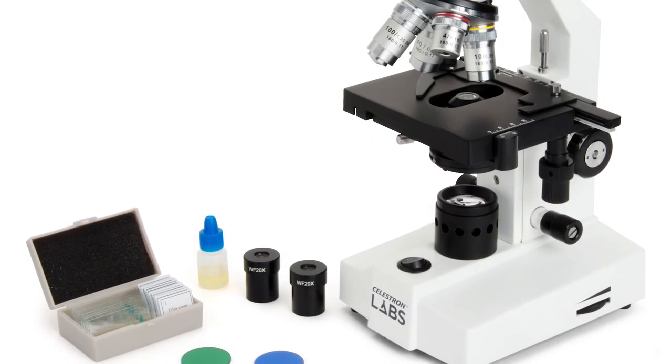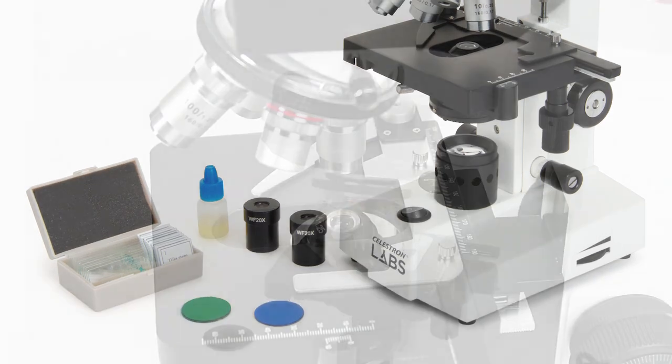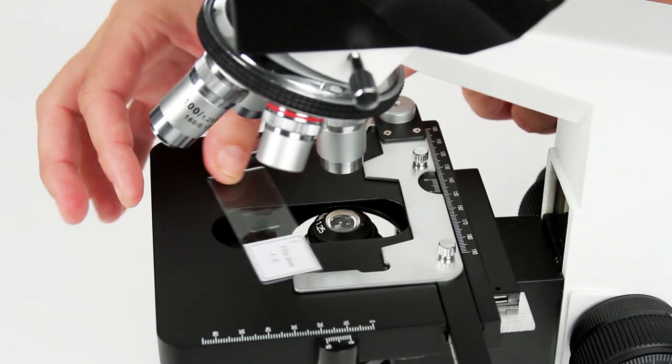All seven models in the Celestron Labs family include prepared slides or 3D bug specimens to get you observing right away.